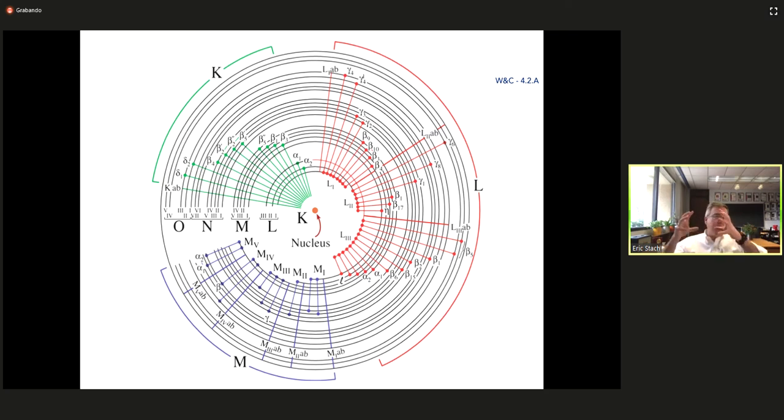So if you had a particle that was, you know, a 10 micron particle embedded in resin, what you would need to do is go to the focused ion beam instrument and thin a section of that down, right? So that you could then put it in the TEM, have it thin enough to do all the work you wanted to do. So my answer to you would be, if your sample's big and your goal is not ultra high resolution knowledge, you're better off using X-rays.